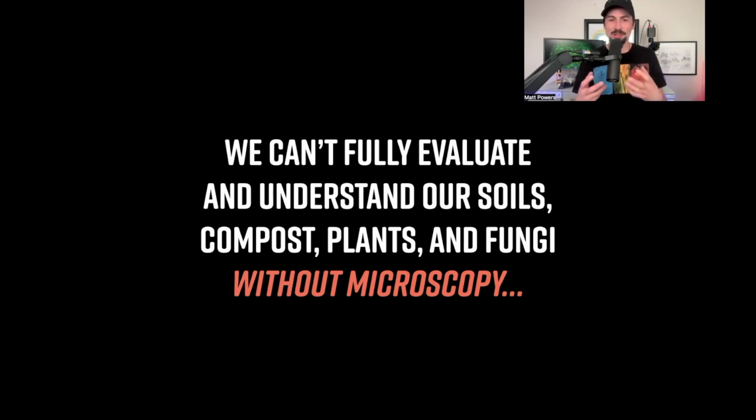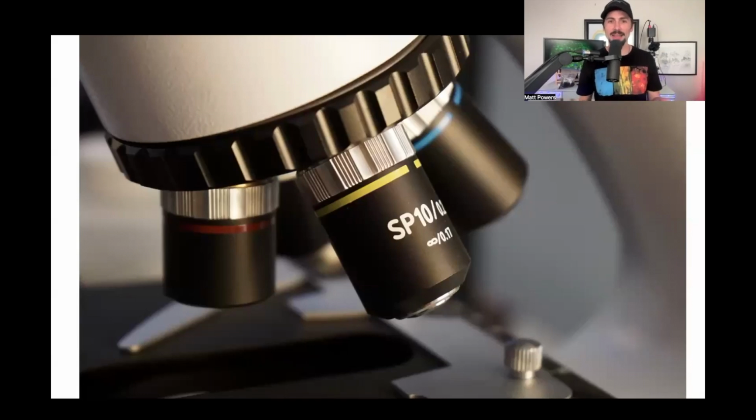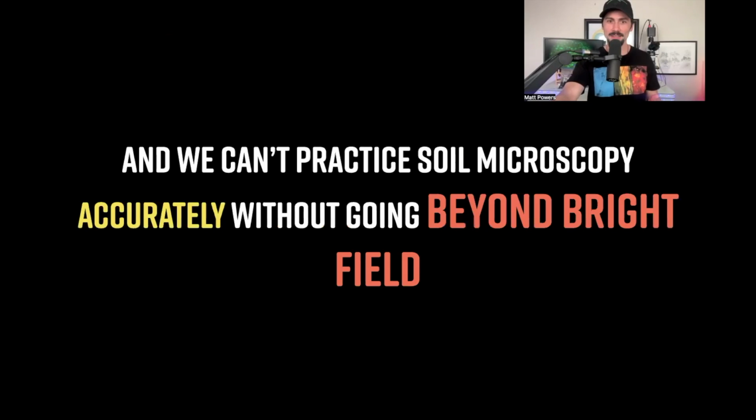I mean, you're keeping things alive. You're checking out how they actually work. You're getting in there, seeing it for real. So without microscopy, none of these things actually find their proper grounding. And we can't practice soil microscopy accurately without going beyond bright field because we're so limited.